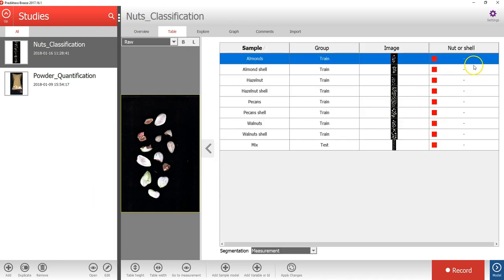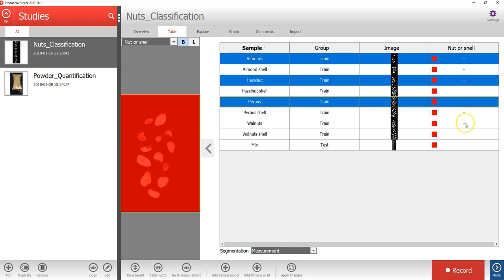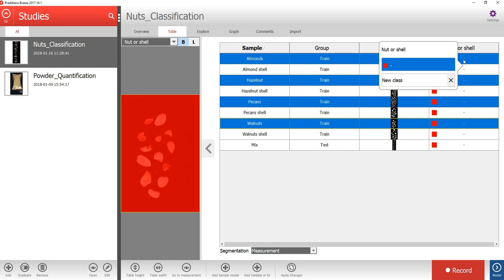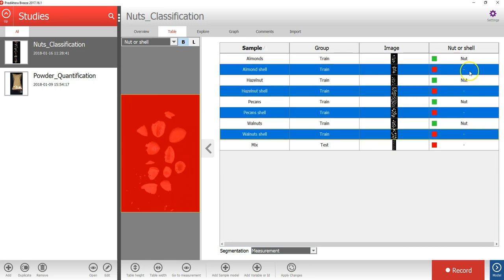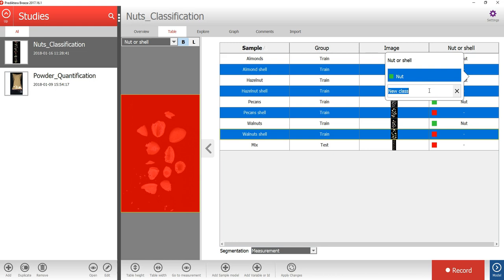A column for the nut or shell variable has now been added to the table. Hold down CTRL on your keyboard and use your mouse to select all the nut samples — so the almond, hazelnut, pecan, and walnut are selected. Then I will right-click on the selected row and write the name 'nut'. In the same way, I will then select the samples with the shell, right-click, and write the name.